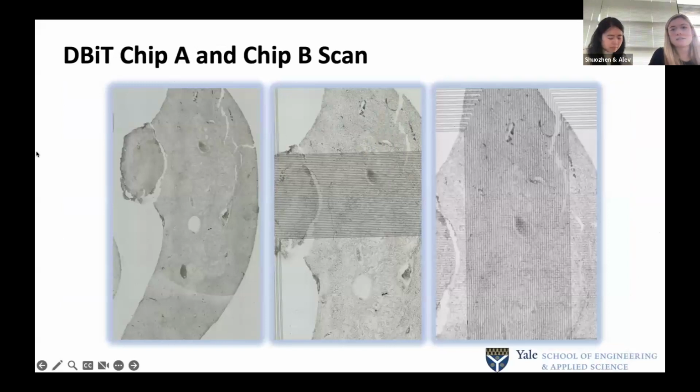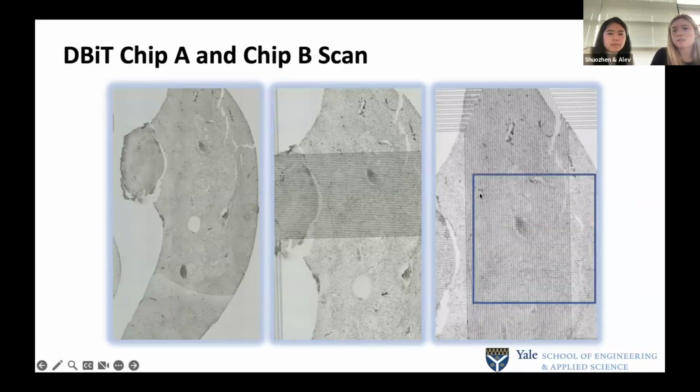And then finally, here's another image showing, in this case, a liver tissue prior to barcoding and reverse transcription. And then this is putting our first direction chip on the tissue, our second direction, and you can see it creates, sorry, this is a little bit off center, I think, of formatting, but you can see right here, it should be a nice square ROI for our downstream analysis.